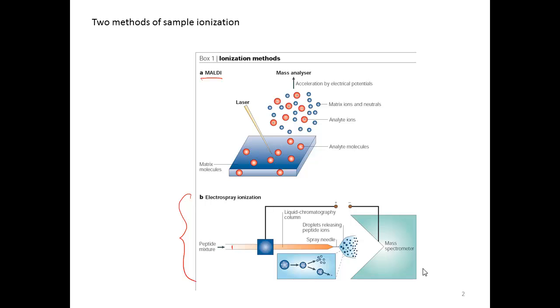Frequently here, peptides are associated with maybe 1 or 2 water molecules, which then will really quickly evaporate in the gas phase in the heated inlet tubes of mass spectrometers. So eventually what you have is a positively charged peptide, naked peptide, in gas phase being directed towards the inside of the mass spectrometer by a negative electric bias, and then it'll be analyzed inside the mass spectrometer.